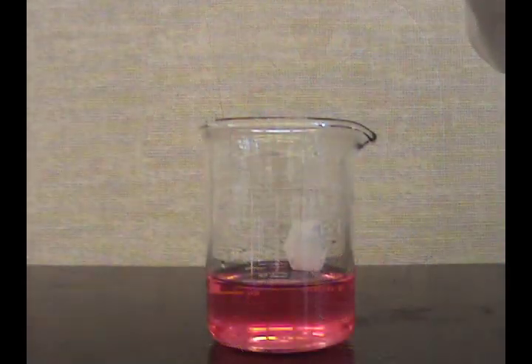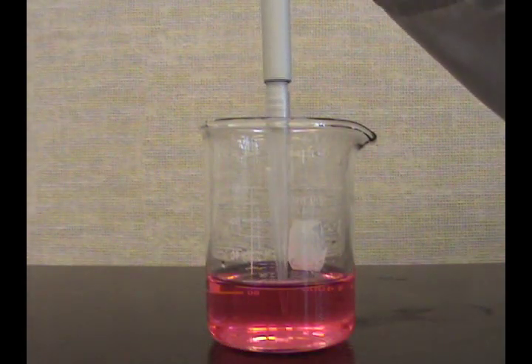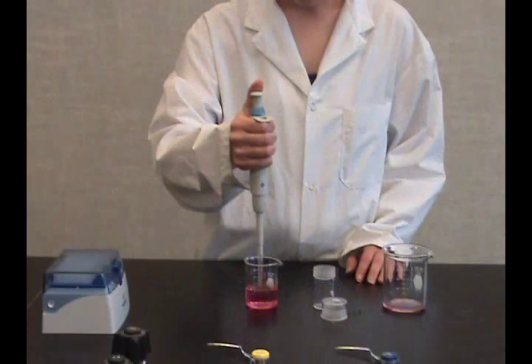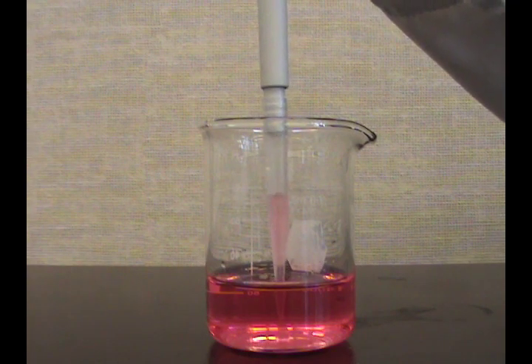Immerse the tip in sample, keeping the tip at a sufficient depth that no air will be drawn up into the tip. This can cause damage to the pipette if any liquid gets into the shaft. Draw the sample by slowly releasing the plunger. The calibrated volume will be drawn up into the tip.